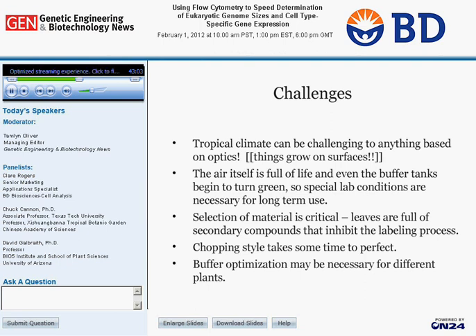Whether you're using mature leaves or root tips, your chopping style has to change slightly, and you just have to be patient with that. That was the most challenging thing that Ms. Chen faced in her studies.